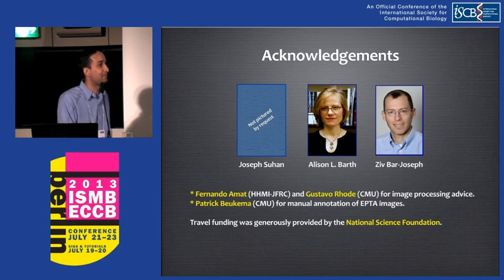Okay, maybe last question. My question is on the part of classification. I would be interested to know if you thought to use an unsupervised approach, since you have some data that are your test set for good embedded samples, you could embed these in one dimension. I imagine that they are ordered in one dimension if you have a good embedding, and then you could see where your synapses are falling on that dimension. So a completely unsupervised approach. That was my original attempt.